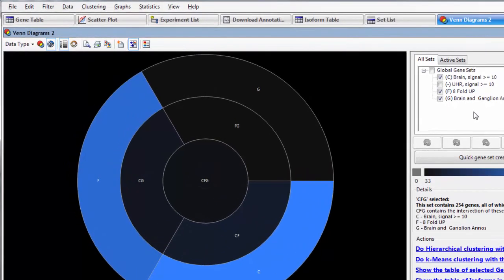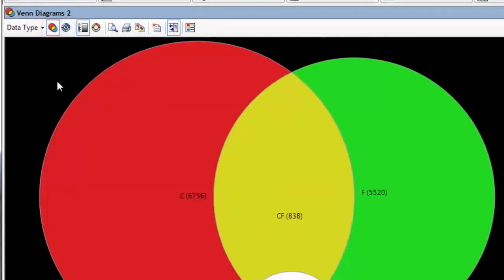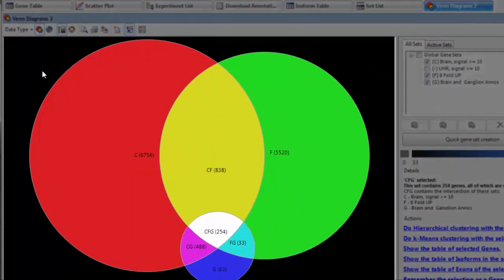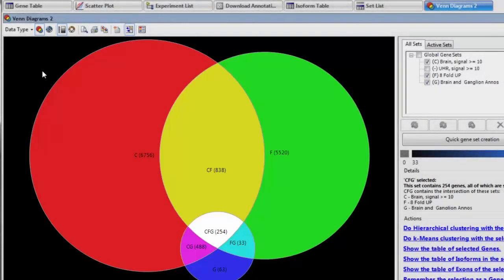To switch to the Venn mode, I'll click on this button here. This mode can be used to compare two or three different sets. Here, each set is represented by a circle, and the areas where the circles overlap represent groups of genes that are common between the sets.